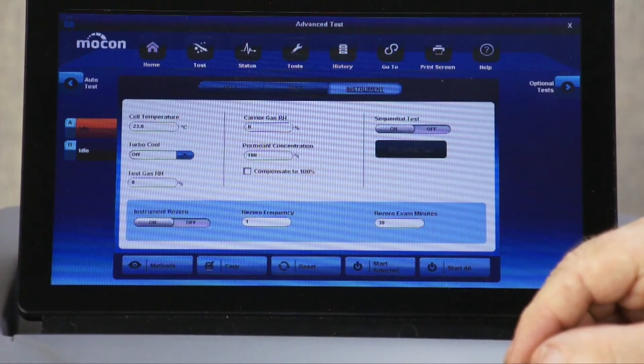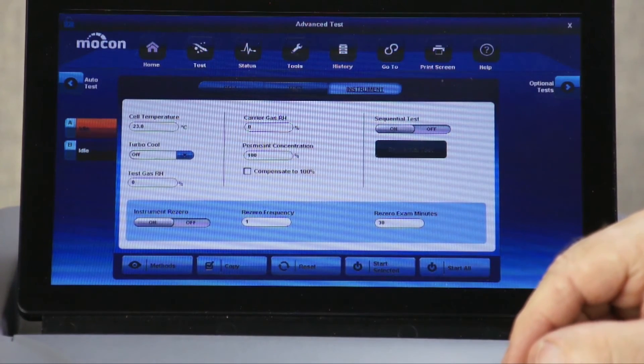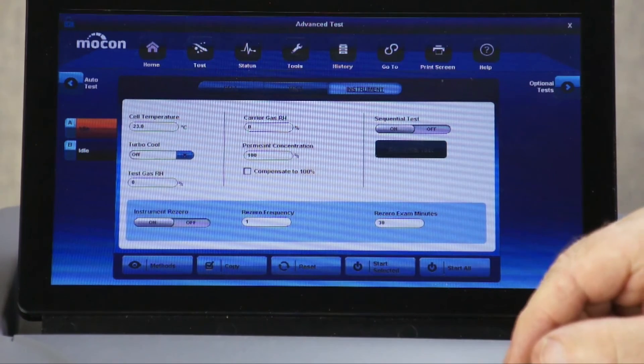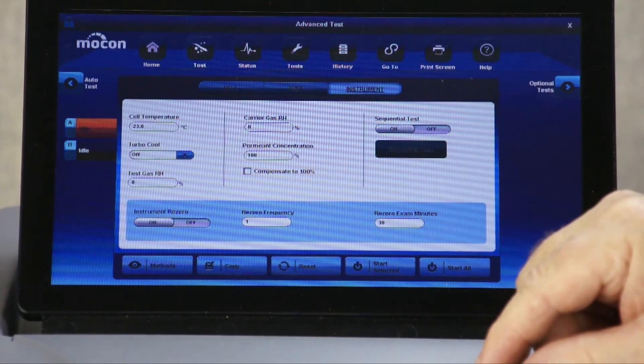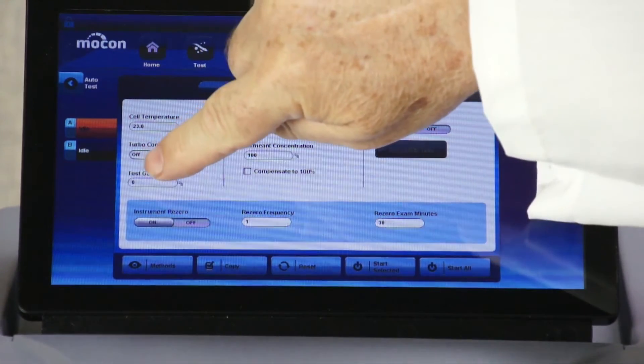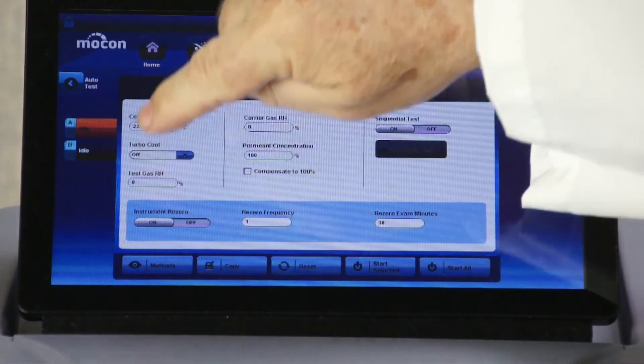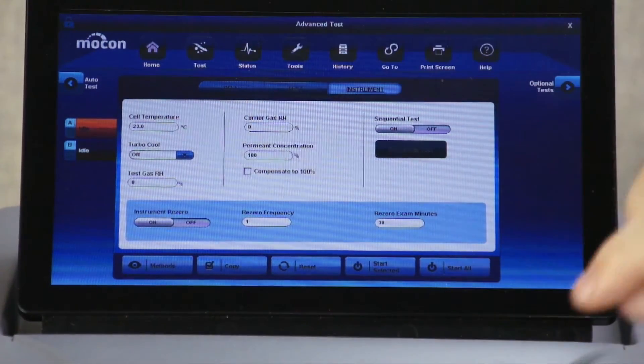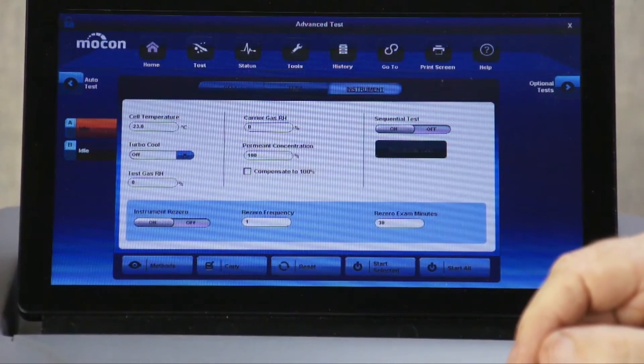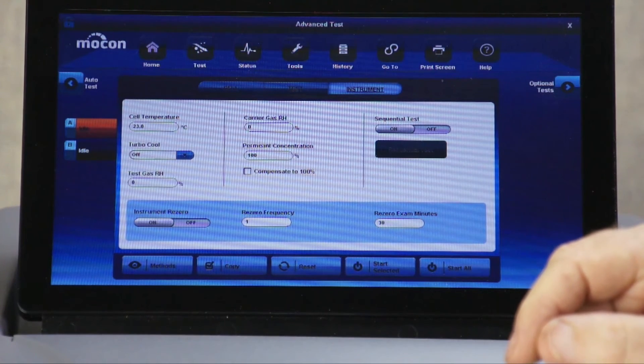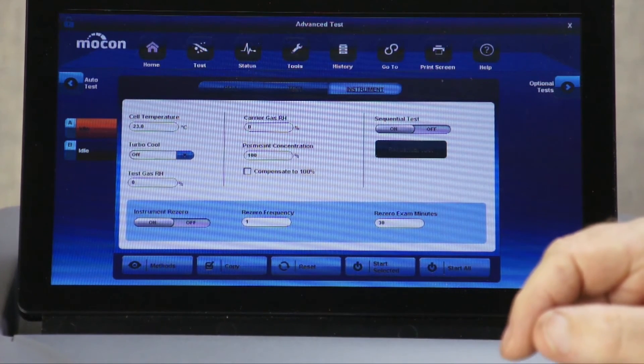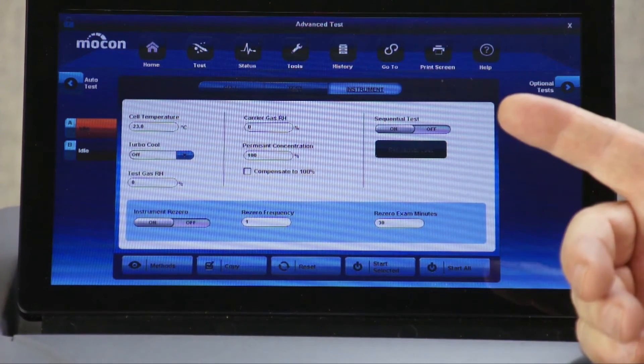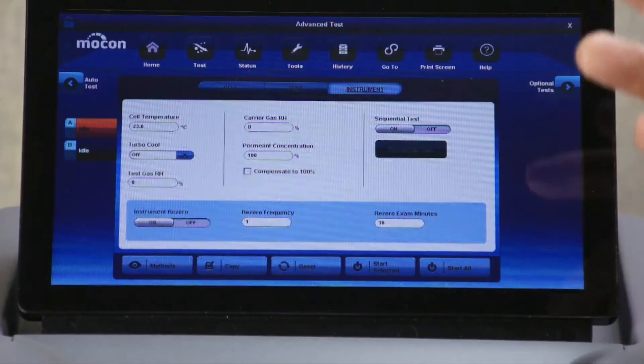Those labs which move between wet and dry testing will appreciate that they can select dry testing simply by selecting zero humidity in the test setup, here for test gas RH and here for carrier gas RH. No more emptying the water reservoir, no more wasted gas drying the system, imagine the time savings.